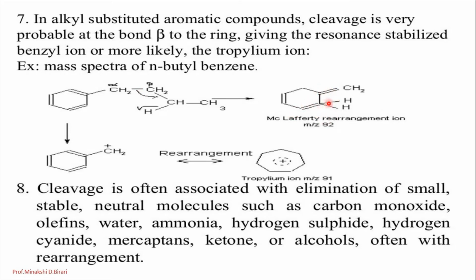Further, this fragment undergoes resonance stabilization, and due to the resonance stabilization there is a formation of the tropylium ion. Also there is a formation of a benzyl ion, more likely the formation of a tropylium ion, and due to the formation of the tropylium ion we get the peak at m by z 91. So that is also an important thing.